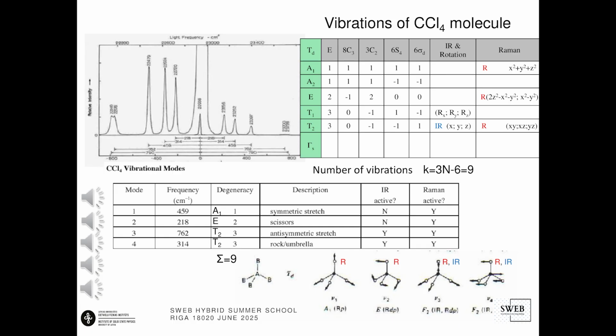Carbon tetrachloride has one of the simplest Raman spectra, but the same principle applies for all samples. Raman spectroscopy is used to measure the unique vibration fingerprint of the sample. From that information, chemical, structural, and physical properties can be determined.